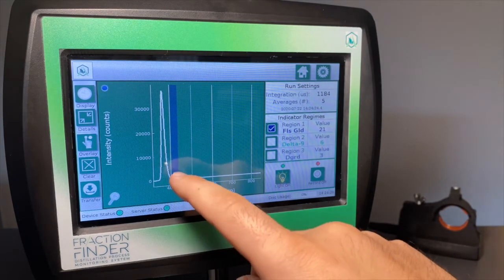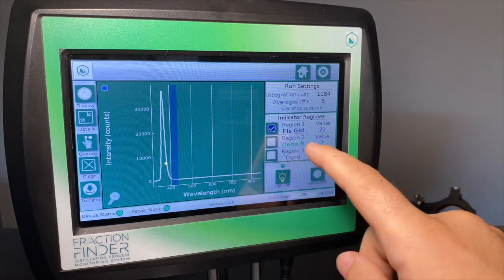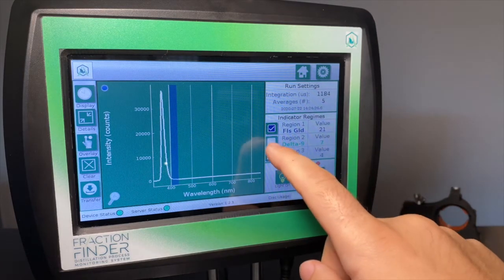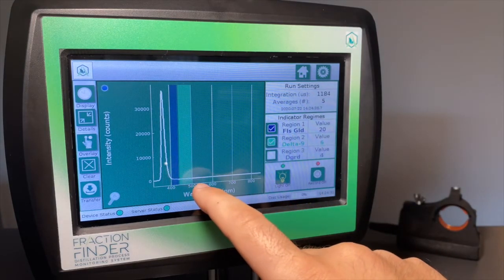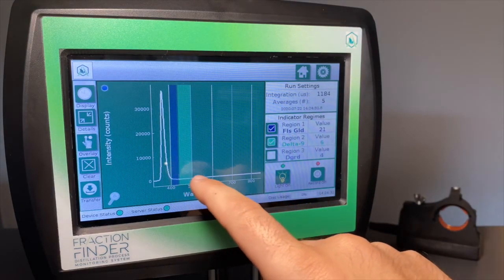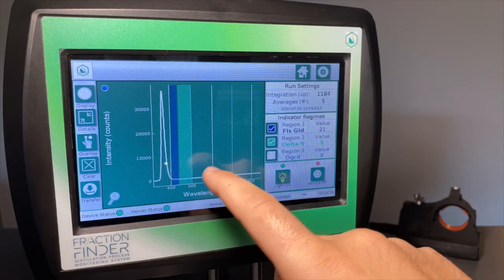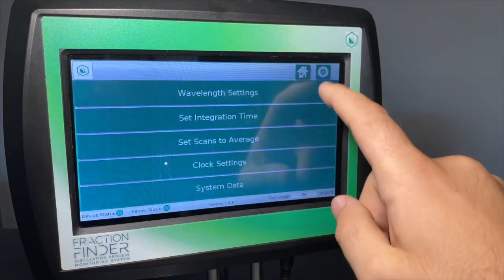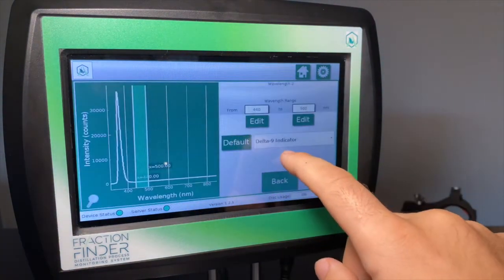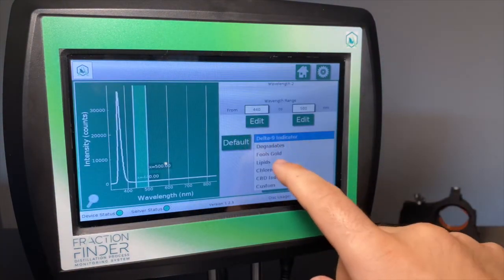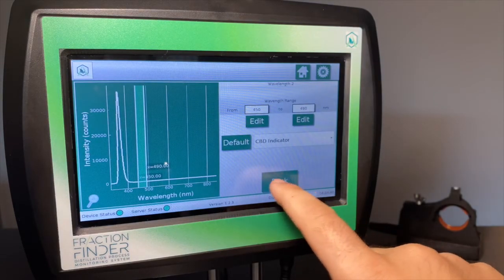Then you can select your region 2 as Delta 9 and that's going to track your main body. If you prefer, if you're not distilling Delta 9 and you prefer to track CBD, you can also do that.